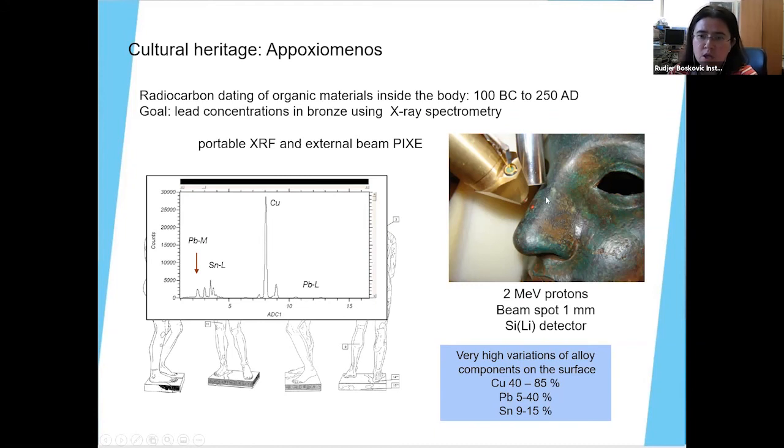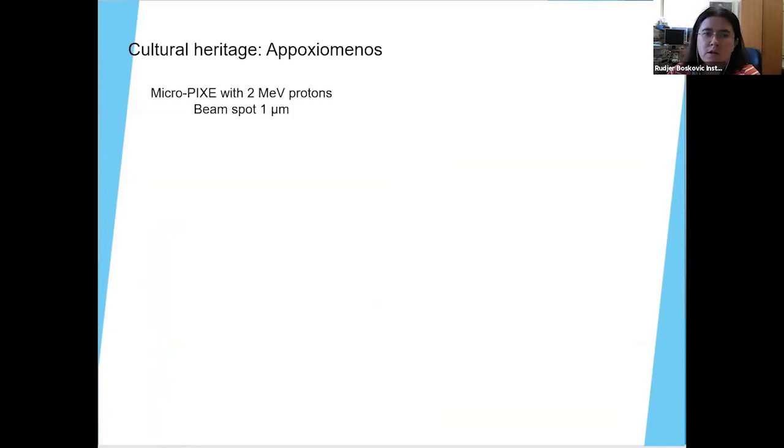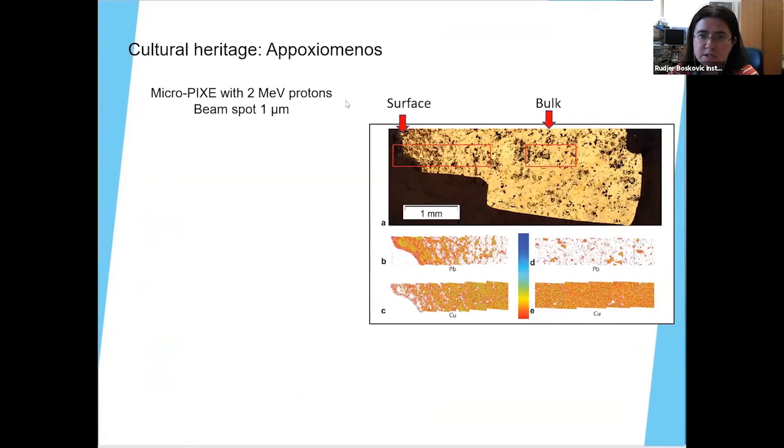because basically you analyze the surface, which was for a very long period exposed to seawater. That's why the bronze deteriorated with time. So what we got were cross sections, small cross sections, so for example, here was the surface of the sample.